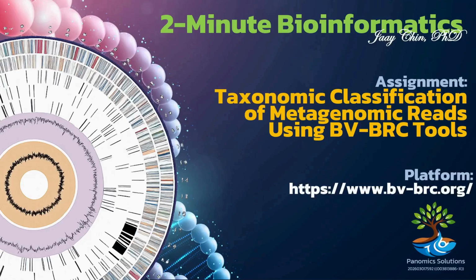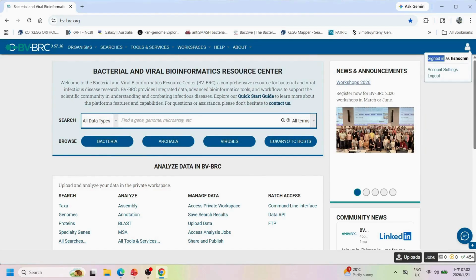In today's tutorial, we're going to learn how to perform taxonomic classification of metagenomic reads using BV-BRC tools. Taxonomic classification is a crucial step in metagenomic analysis. It helps us identify which microorganisms are present in a sample.